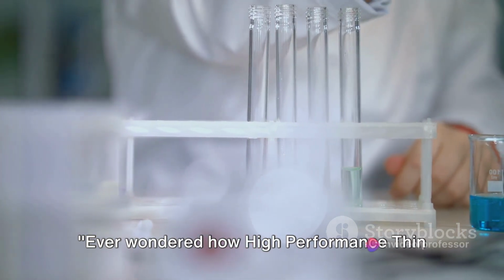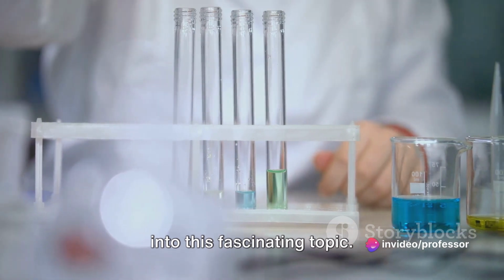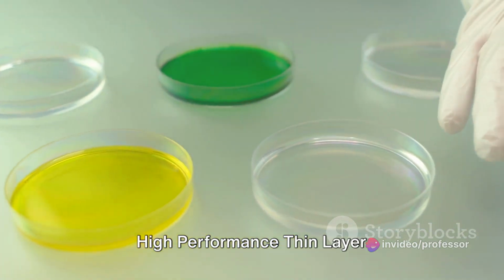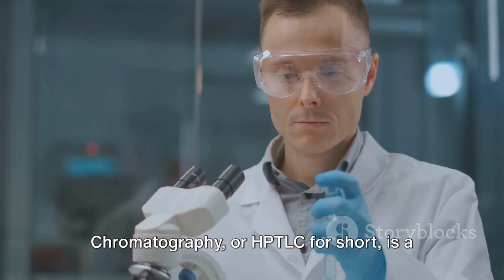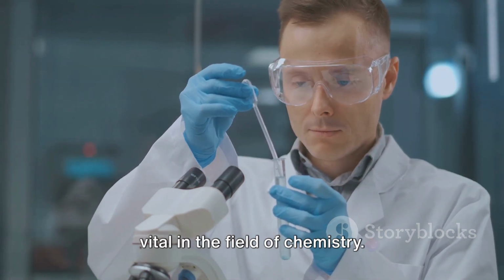Ever wondered how high-performance thin-layer chromatography works? Today, we dive into this fascinating topic. High-performance thin-layer chromatography, or HPTLC for short, is a sophisticated analytical technique that is vital in the field of chemistry.